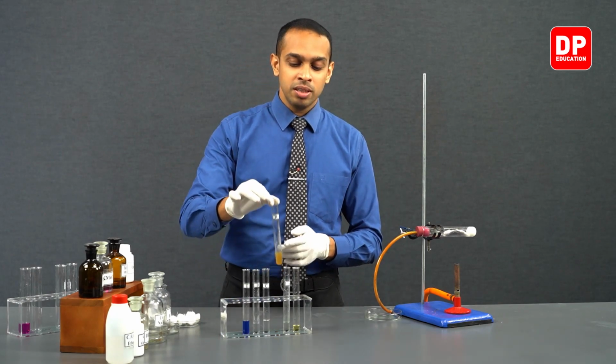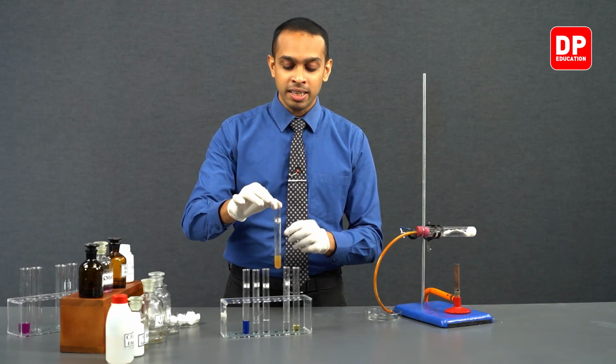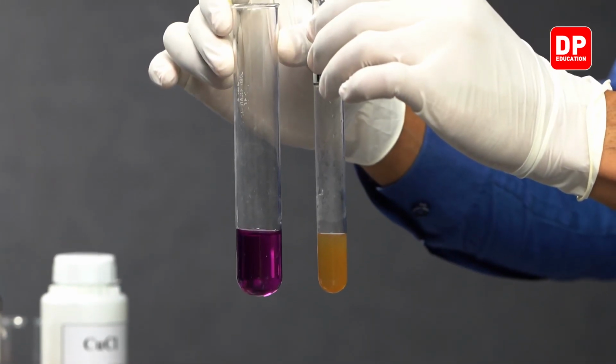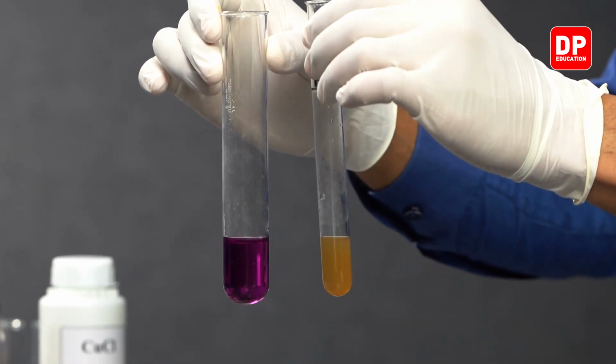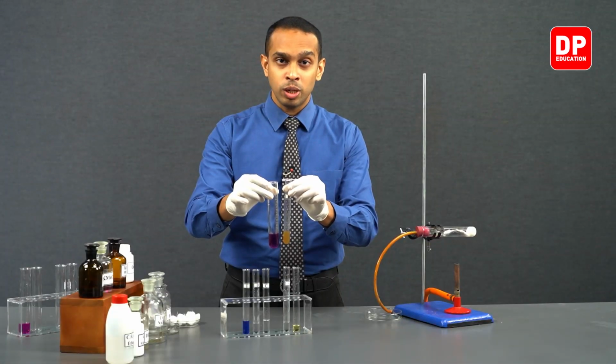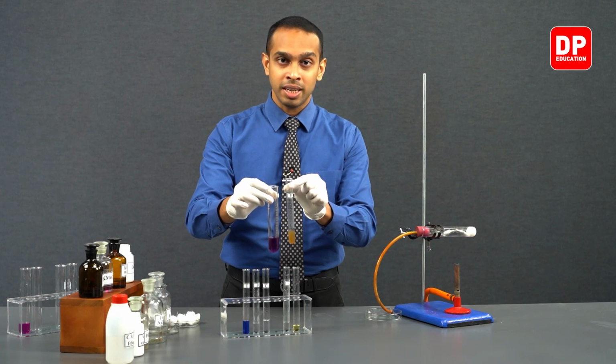Then in test tube B, we had alkaline dilute potassium permanganate, and it was purple in color.